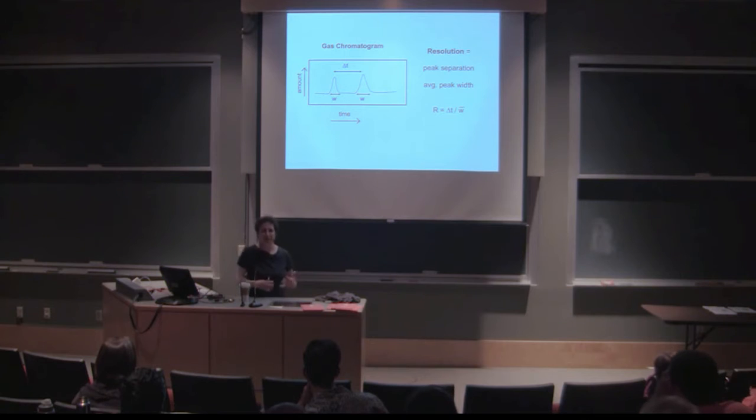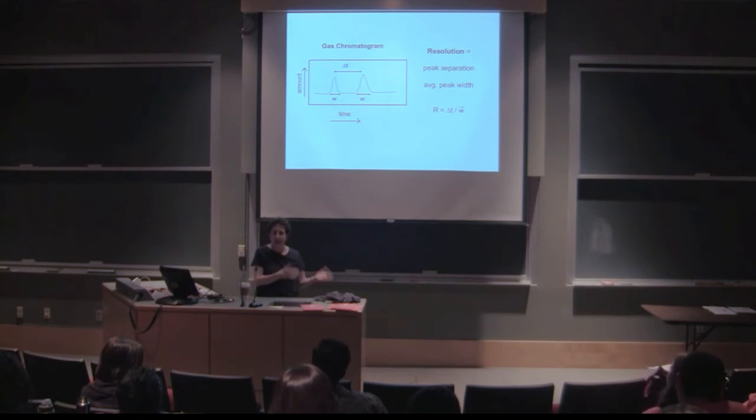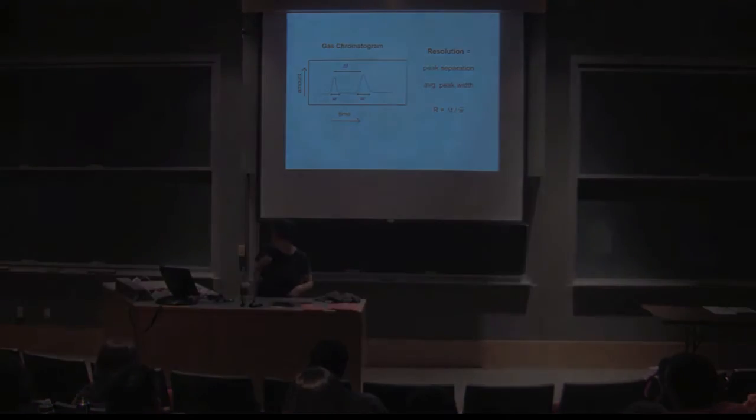This is this really powerful metric called resolution. And I want you all to know this because it's insanely simple. But it's also really, really powerful. And the separation is measured by this distance, or so the difference in time that they elute, divided by the average width of a peak. And so you can run your sample through a GC, and measure this. It's not hard. And then you can tweak the conditions, maybe the ramp rate or maybe the flow rate, and then see if you've improved your separation. And it's a really nice and very standard way to handle kind of the tinkering of conditions to optimize for a particular application. So if you're working in a lab where there's a GC, and some other student has been running it, and they hand it off to you, and you think, oh, great, I'll just use their conditions. Well, now you don't have to. You can measure your separation and decide, is that right for my samples? Can I tinker with the conditions and make this a little bit better?